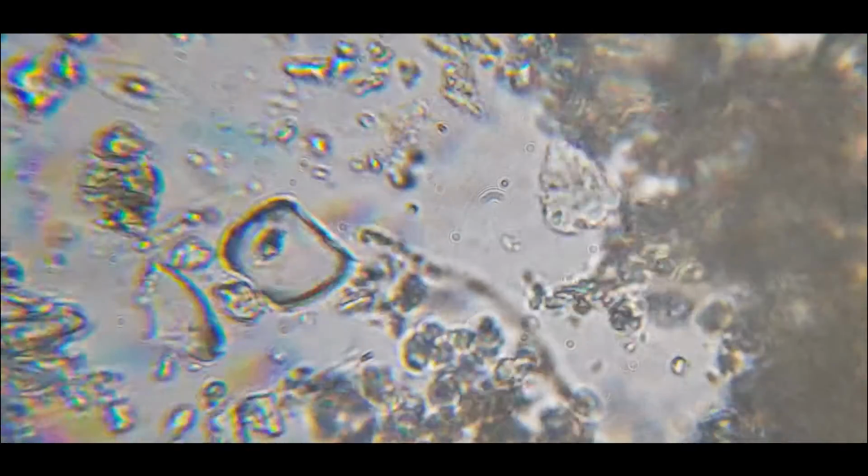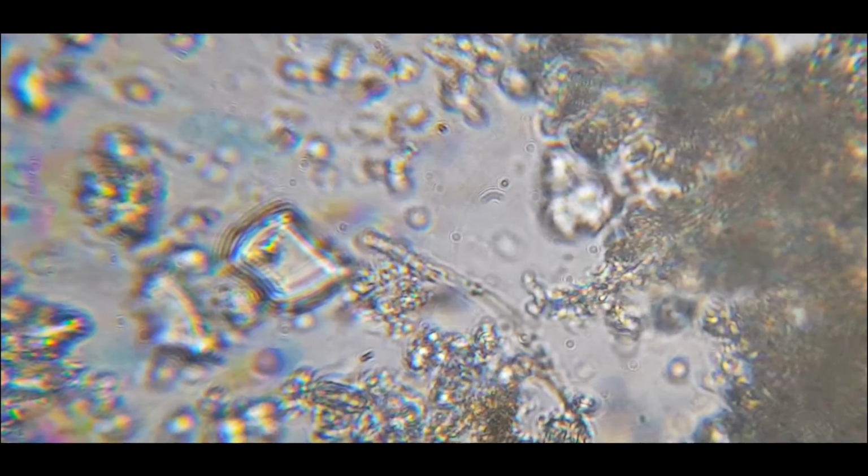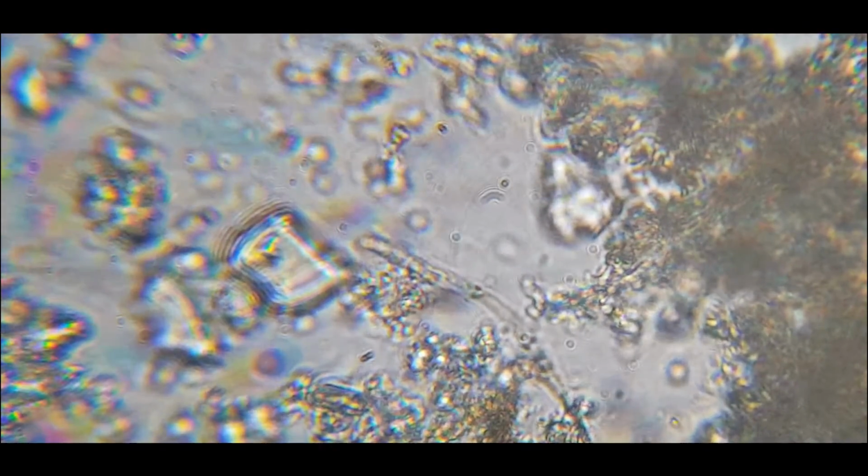Now we are going to add 70% ethyl alcohol. 3, 2, 1. Look at how alcohol destroys everything on its path. It's killed those bacteria just in a second, because alcohol spread too fast on the river water.